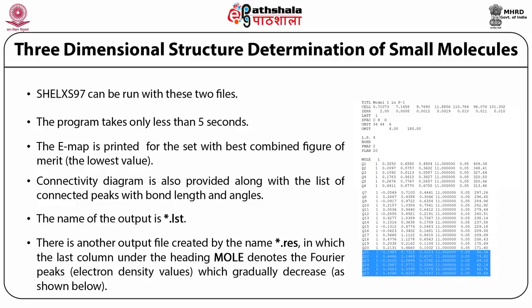Then these positions are only rough positions, which can be adjusted by a slight movement of delta x plus or minus and so on, delta y and delta z. Here, you see a factor 11. In this program, whichever value you do not want to be adjusted or refined, you have to add 10 to it, which means you already have a value of 1. This is known as occupancy. Since all atoms scatter with full occupancy, you need not adjust it. After that, you are given a 0.05. The output is ready to be submitted for another job, least square refinement.